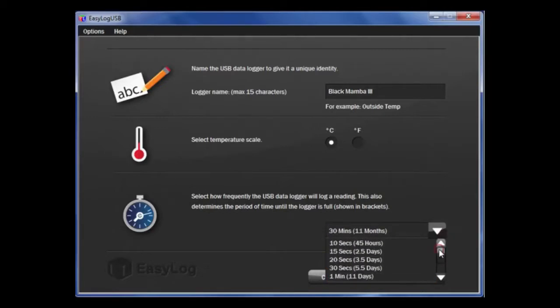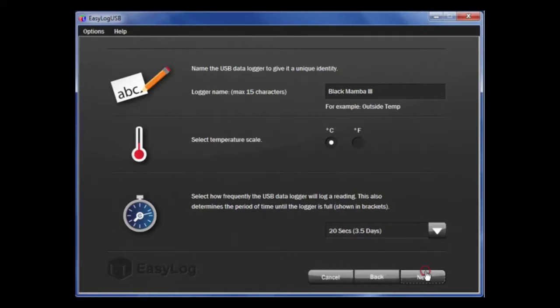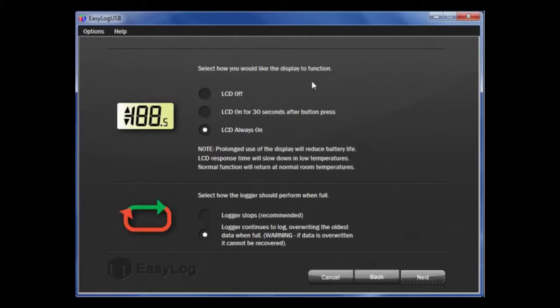Once that is complete, click Next. If you have a data logger with the display, you have a few options relating to the display.